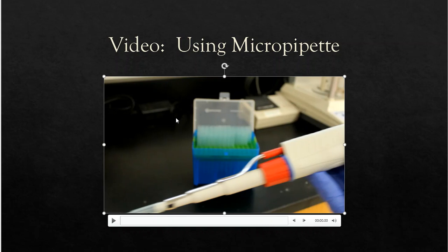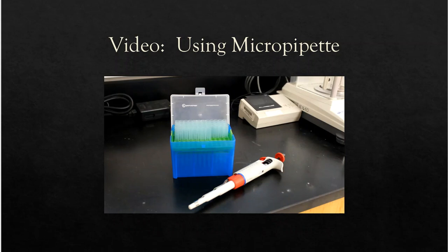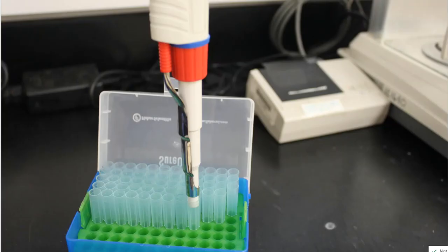And I'm going to be honest with you, I have seen people go crazy with these things. I mean, it's almost like I have handed them a live snake to handle in a laboratory. You know, they don't know how to use it. They're using it the wrong way. I specifically tell them, listen, you need to put it into the micropipette container and pull out your tips that way. And you should see them, they grab the tips and they try to put the tips on by hand. And I'm like, no, you just did not listen to me. The micropipetter is made so you can sit right down on top of the tip and pull them up as you need them.